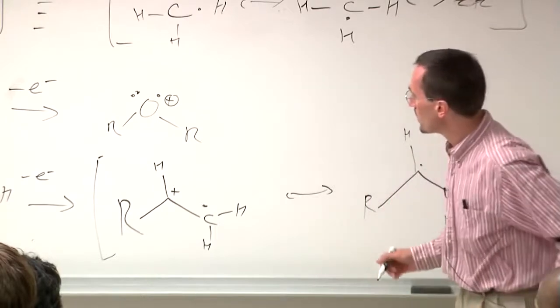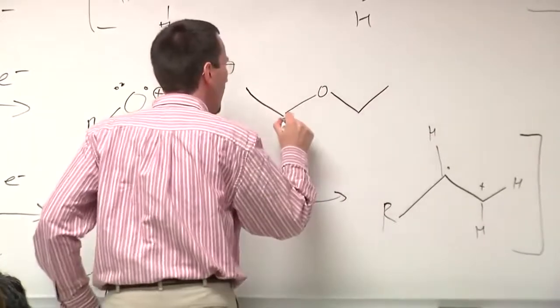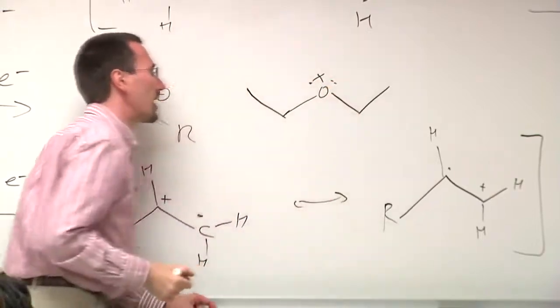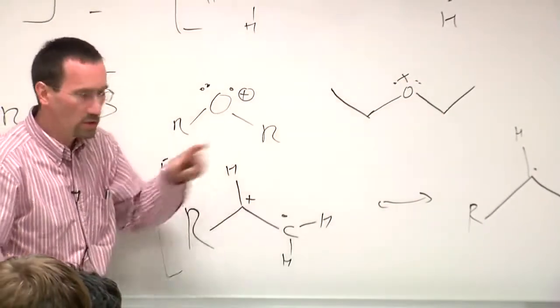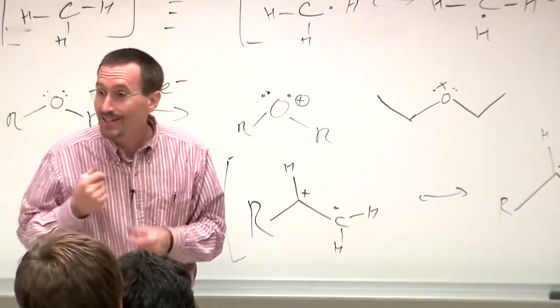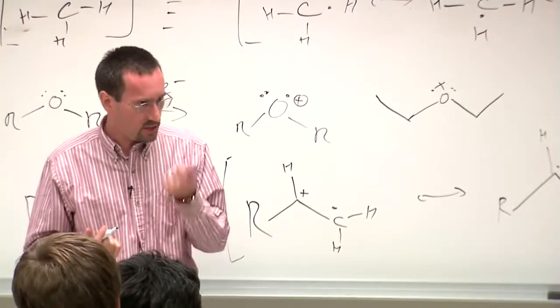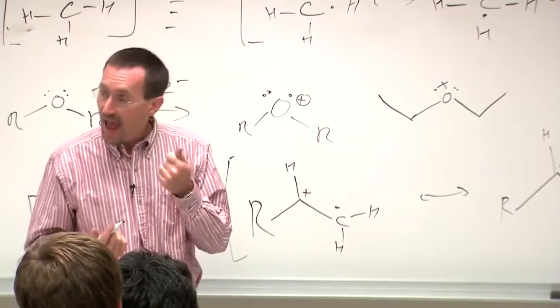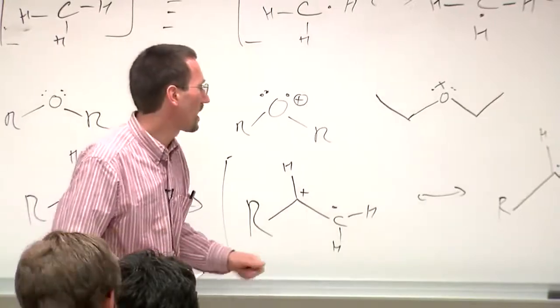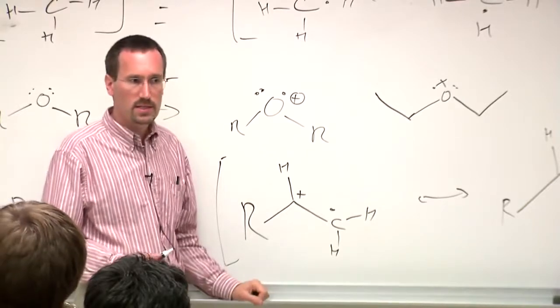So for example, later on we're going to see that if you have an ether, I'll make it simple, like diethyl ether, and this molecule breaks apart, because when you give it a whack with an electron, you put a lot of vibrational energy in. So you've done double damage to the molecule. You've decreased the number of bonding electrons, so you've weakened the bonds in the molecule. And you've put a lot of kinetic energy into the molecule in the form of the impact from the electron. So the molecule now is vibrating, it is hot, and it has a tendency to fragment.